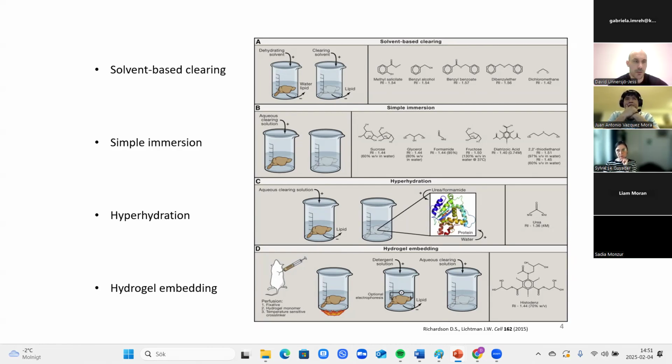There's a huge difference between methanol and ethanol. Methanol destroys completely, for example, the cytoskeleton, and ethanol doesn't. So they behave in a very different way. It's not just about whether they are alcohol or not. Okay, that's good to know. Thank you.